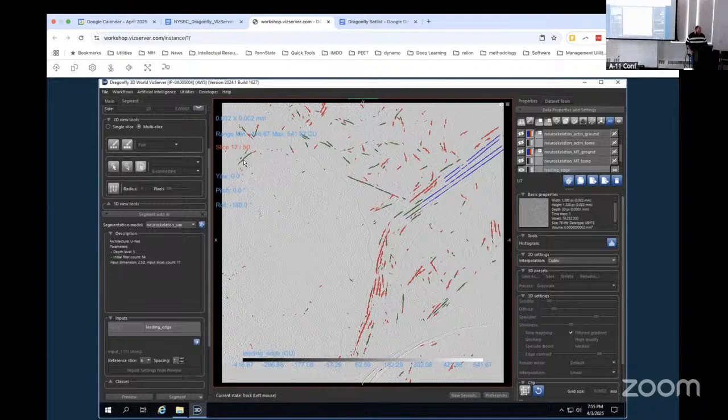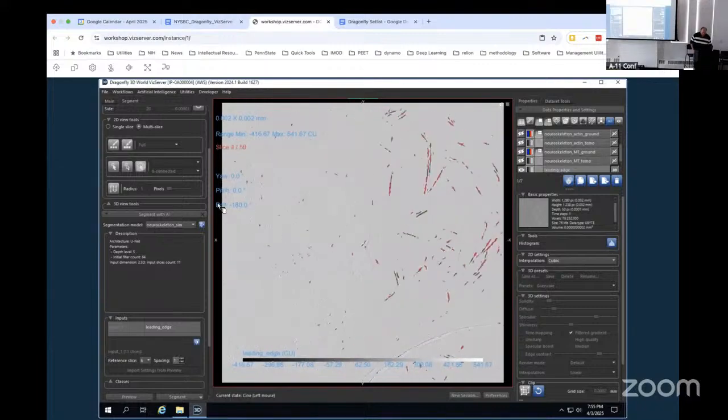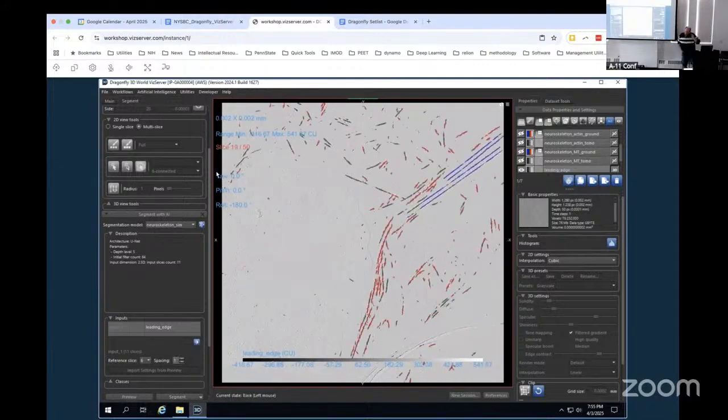It's way more fun than hand segmenting everything. Any questions about that? Yeah, start with synthetic data and bootstrap your way into getting an initial model, and then refine that model. Augment it with real data.